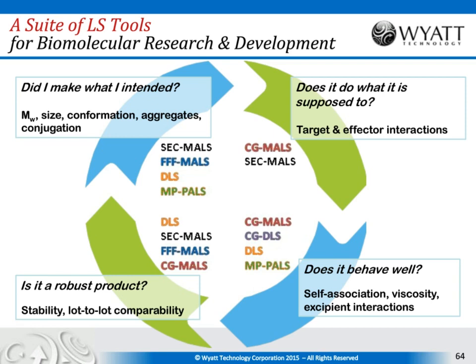First question we have, Dan, is do you require specialized plates for the DLS plate reader? No, these are standard UV plates that you would use in a UV spectroscopic plate reader. They have transparent bottoms, but they're pretty much off the shelf.